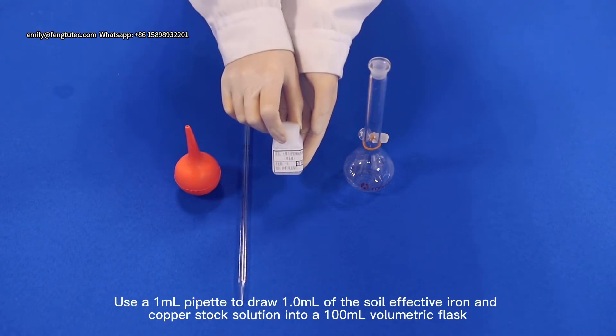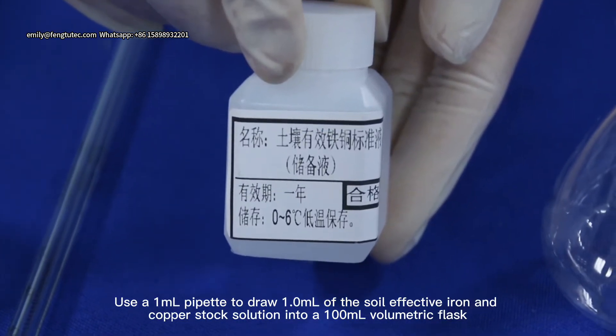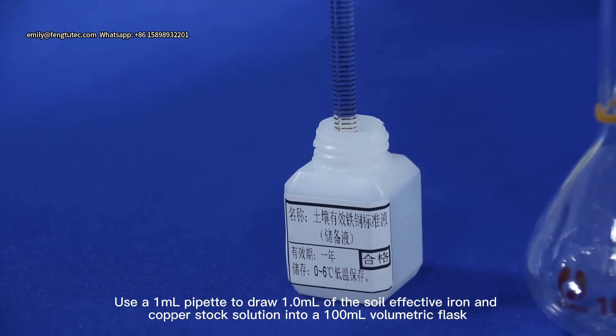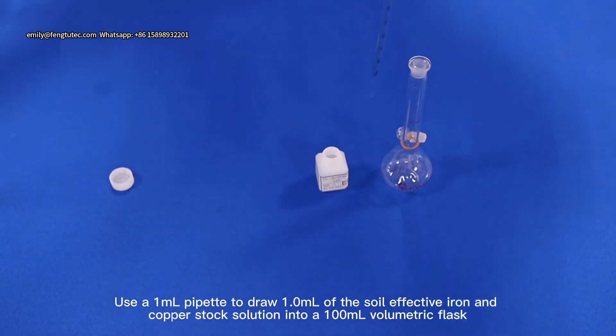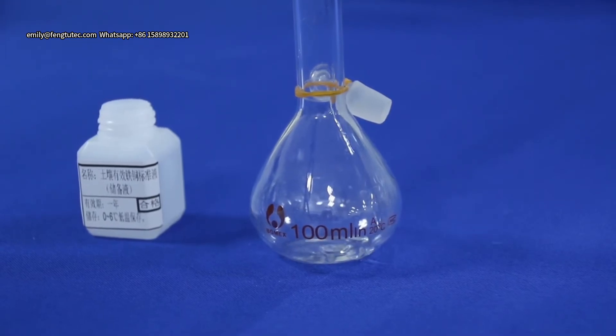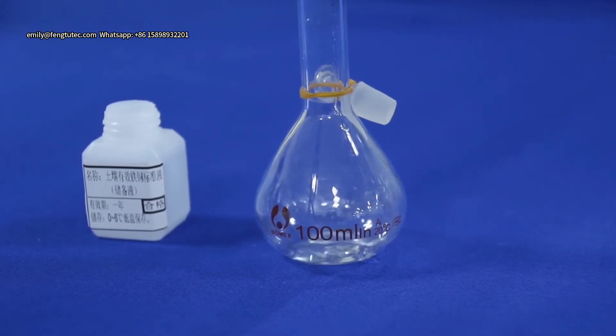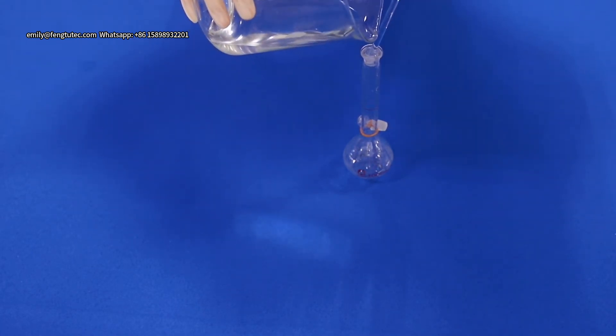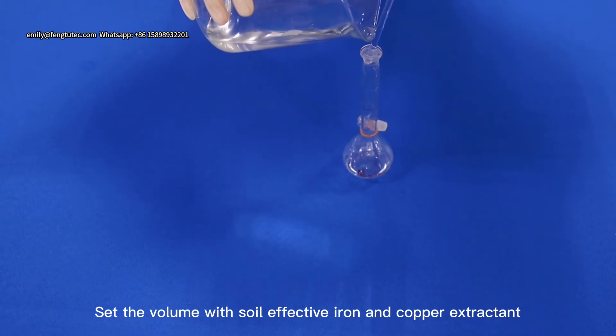Use a 1ml pipette to draw 1.0ml of the soil effective iron and copper stock solution into a 100ml volumetric flask. Set the volume with soil effective iron and copper extractant.